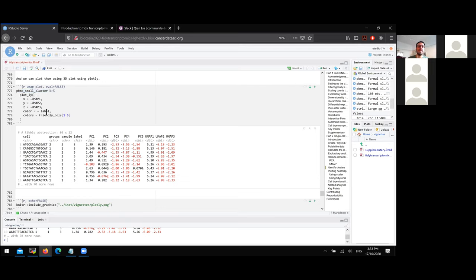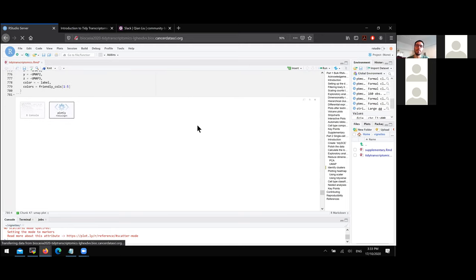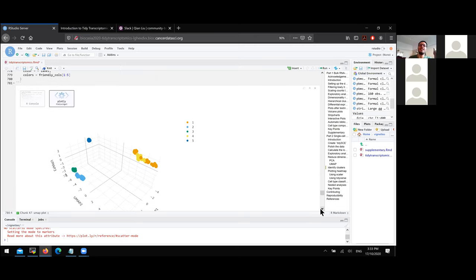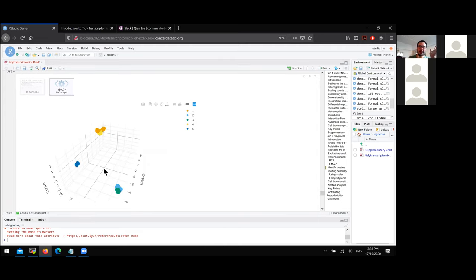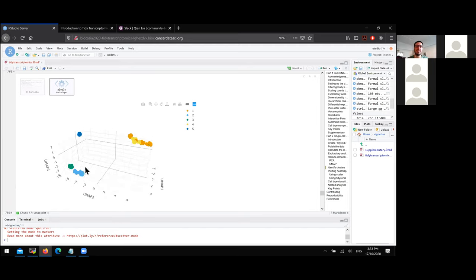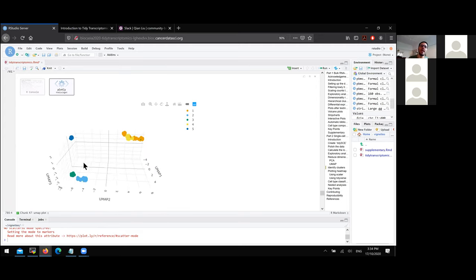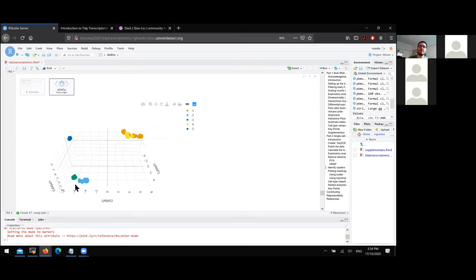We showcase the versatility of the tidyverse infrastructure for visualization: using plotly we can quickly produce an interactive 3D plot using the first three UMAP dimensions, colored by identified clusters. Even with this toy dataset you can see how much more meaning you get from adding a third dimension — the third dimension includes quite a lot of variability. We can see roughly three to four clusters, and the automatic clustering did quite a good job.